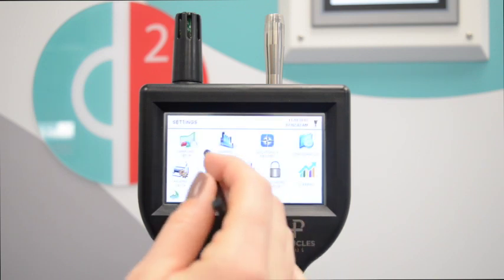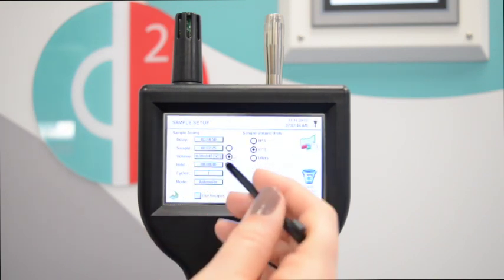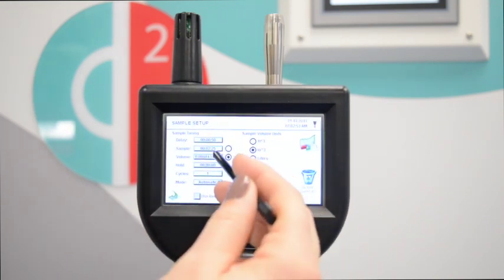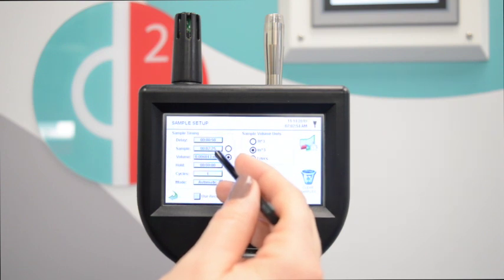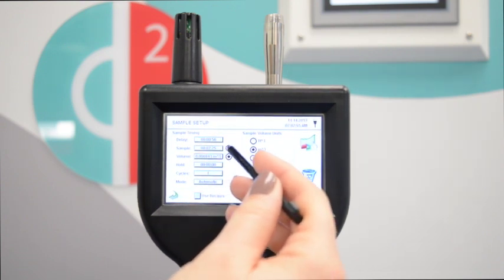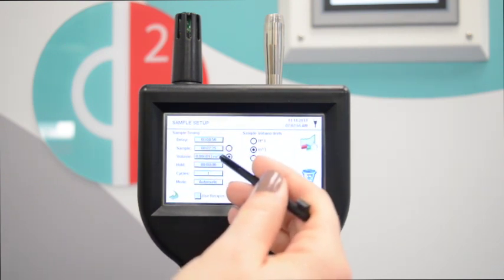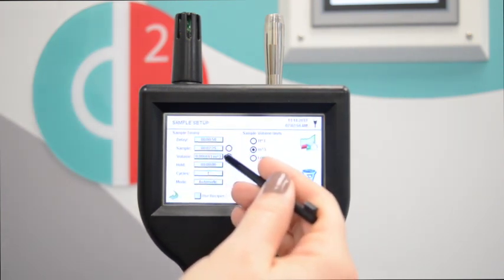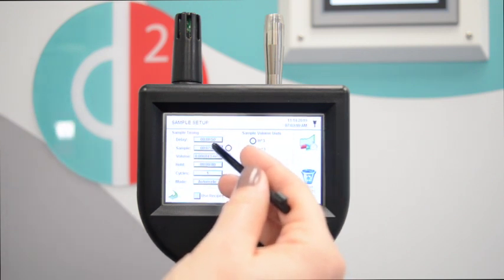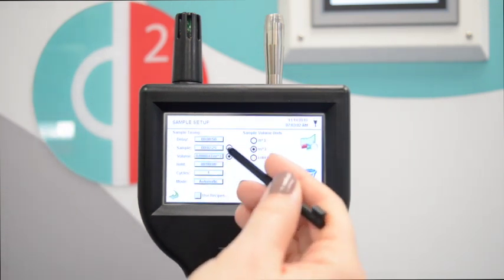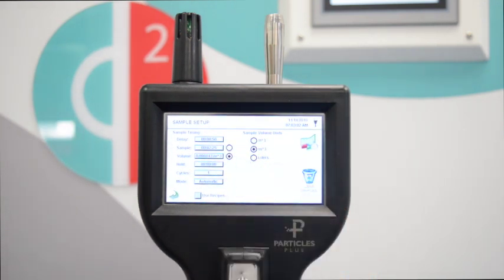If we go to sample setup we can enter that volume and the particle counter will then determine the sample size we need to take. You can see this has now set the sample size to 2 minutes and 25 seconds. These particle counters have a sample rate of 2.8 liters per minute so that sample time will give us the volume we need.